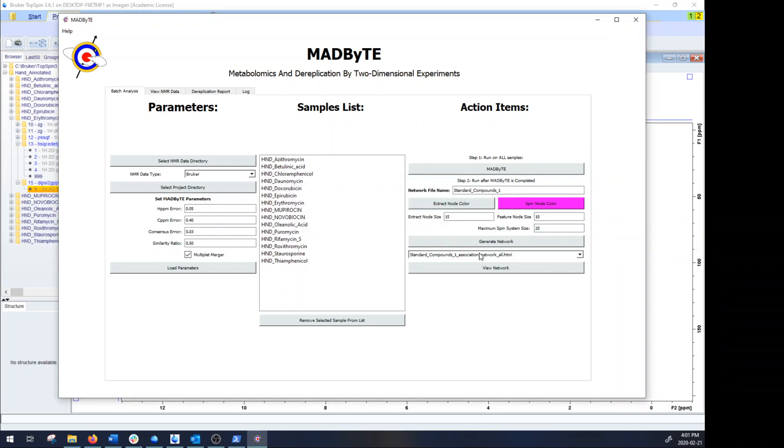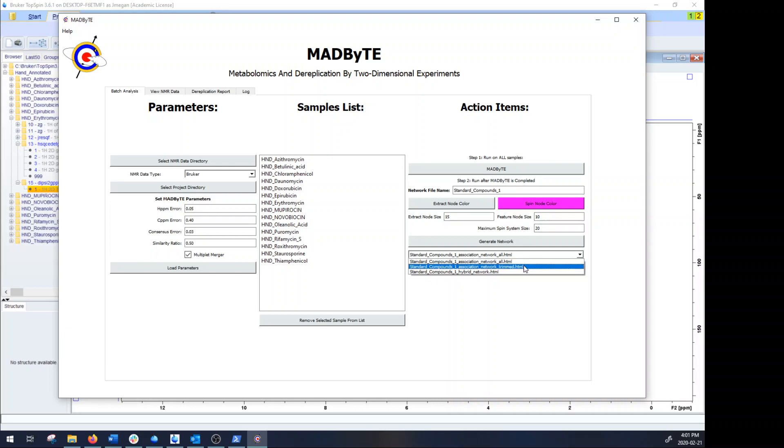So what the generate network button does is it will generate three different networks: the association network, the trimmed association network, and the hybrid association network.